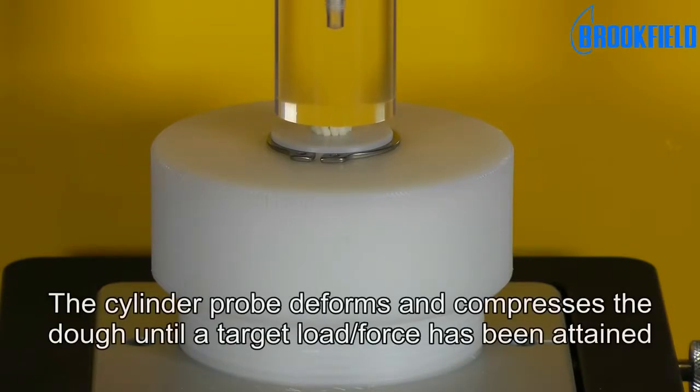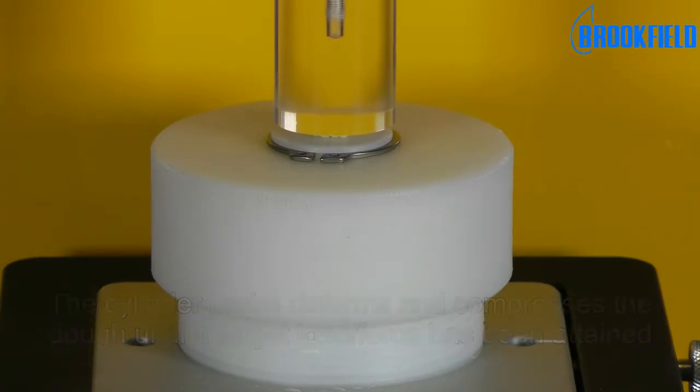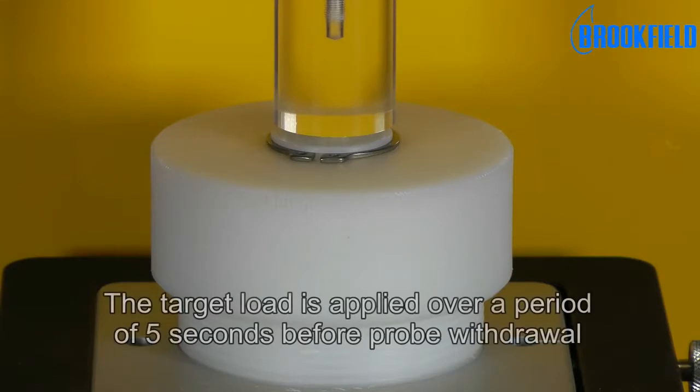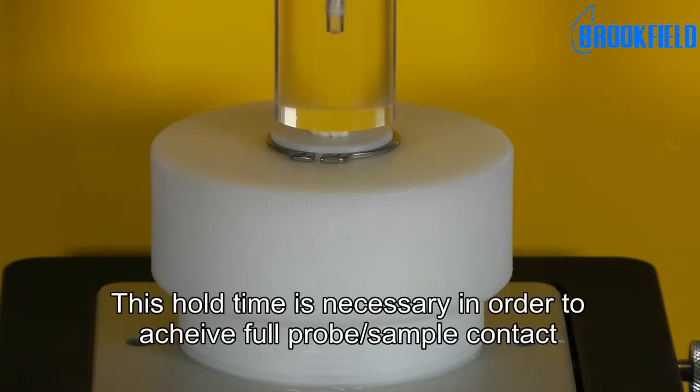The cylinder probe deforms and compresses the dough until a target load has been attained. The target load is applied over a period of 5 seconds before probe withdrawal. This hold time is necessary in order to achieve full probe sample contact.